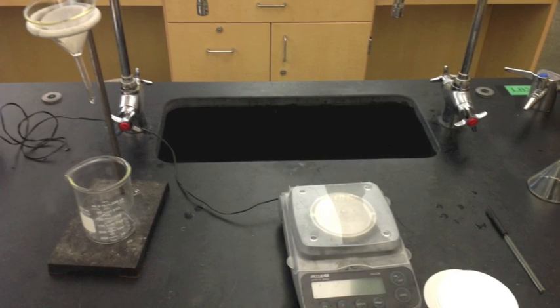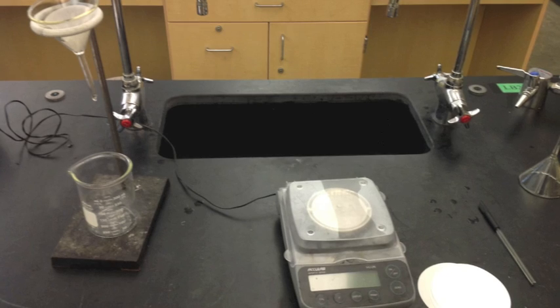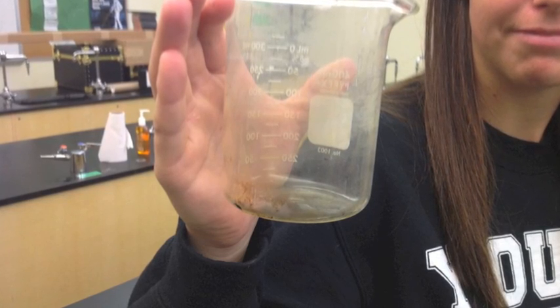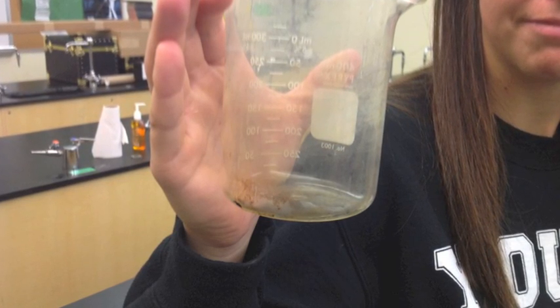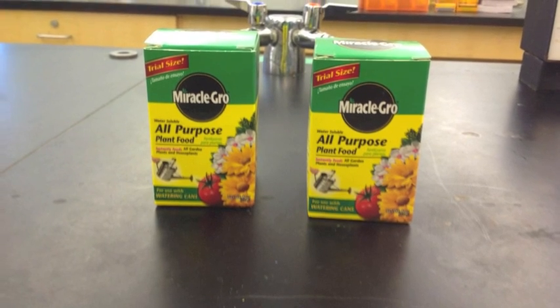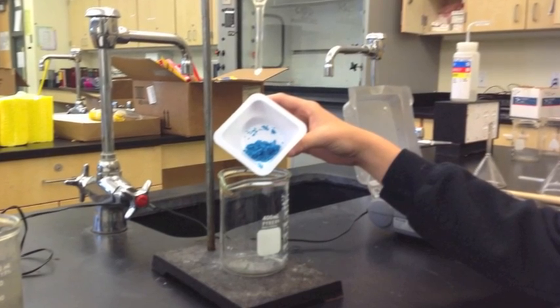Here we have your setup — it's pretty simple: just a funnel, scales, filter paper, and glassware. The glassware should be cleaned; if it doesn't look good, it's not worth using, so keep good clean glassware. Here's the Miracle Grow that you'll be using, and when you dole it out it looks something like that.